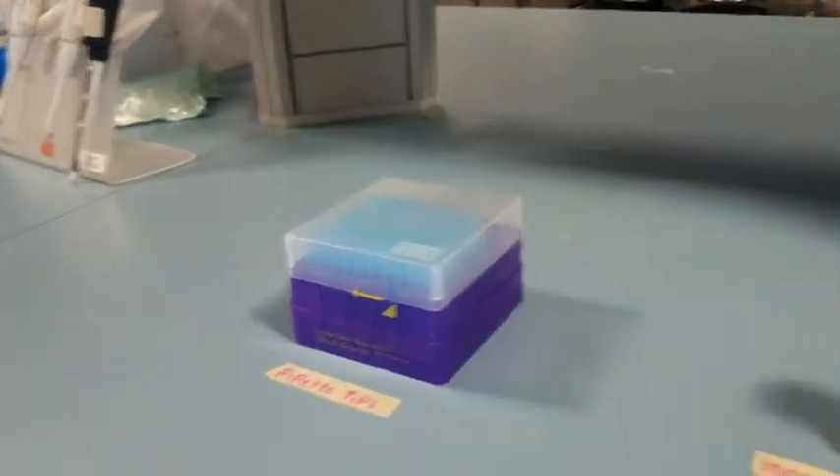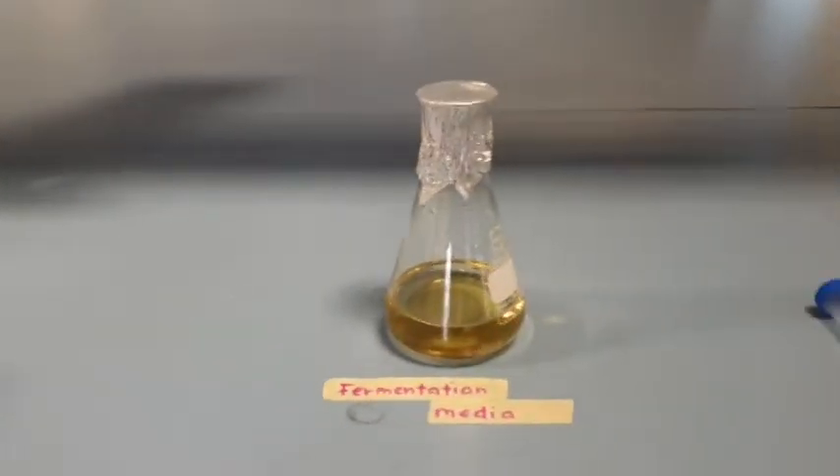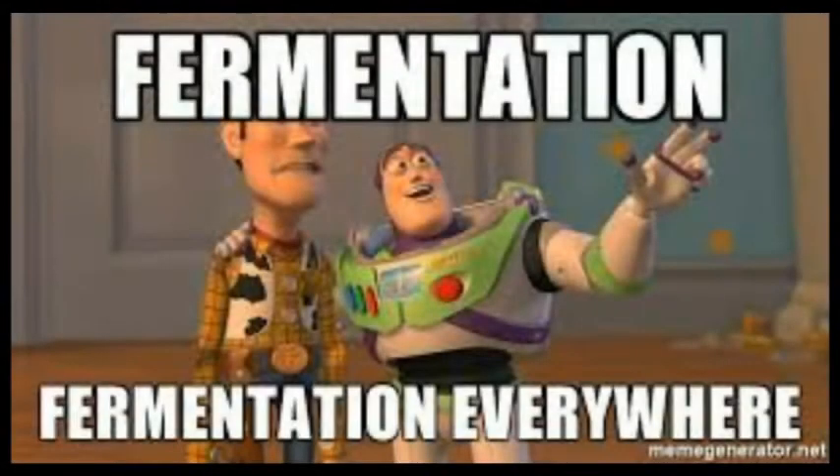Previously, we had sterilized all the necessary materials needed for the fermentation. The materials are pipette tips, inoculum media, fermentation media, and 15 ml tubes. Now that all the needed materials are ready, let us begin with the preparation of yeast inoculum.